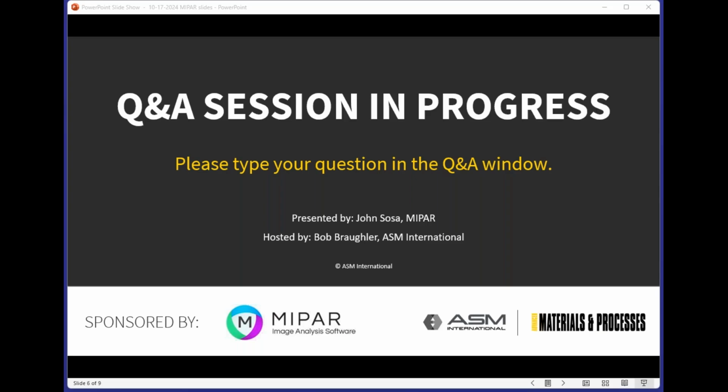Okay, we have one more kind of a broad question, then we'll dig into some real specifics. This question is, what hardware is required to run Spotlight?